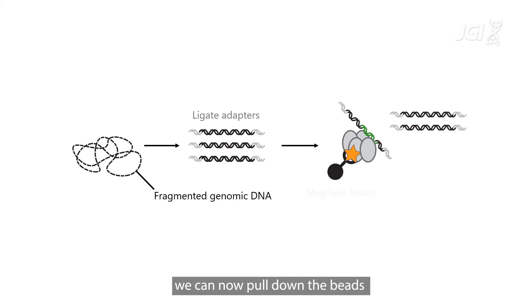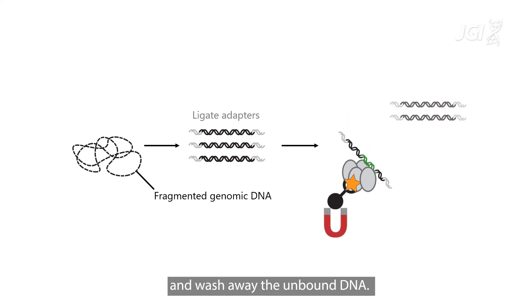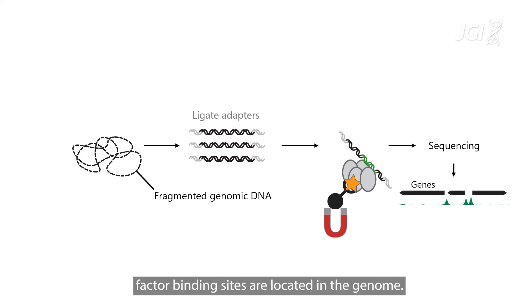Using a magnet, we can now pull down the beads and wash away the unbound DNA. The last step is to load the remaining bound DNA fragments onto a sequencer, which reveals where the transcription factor binding sites are located in the genome. That's the basic workflow for Biotin DAP-seq.